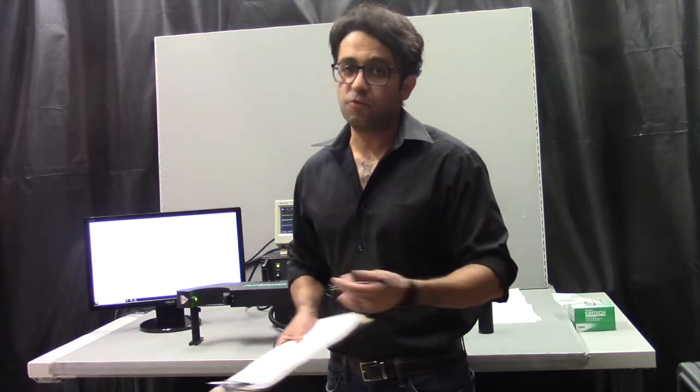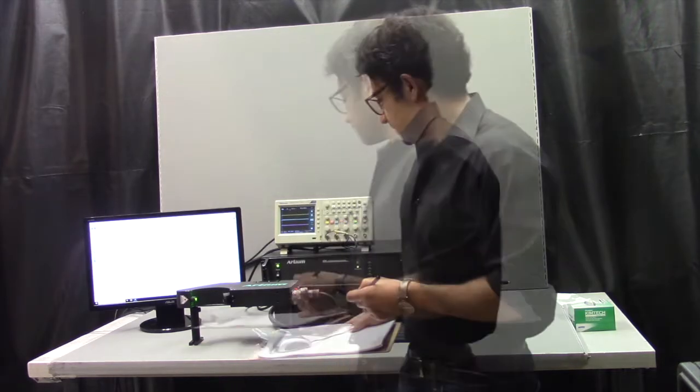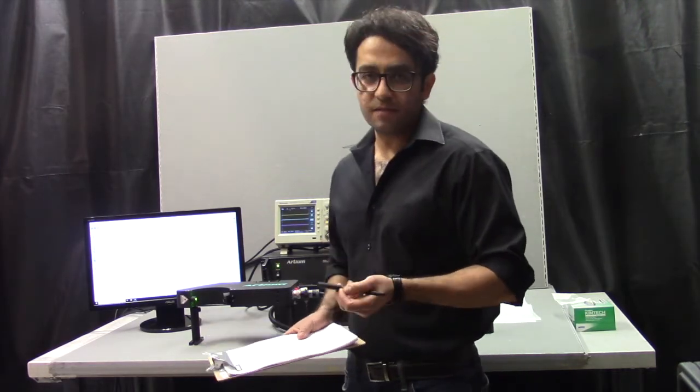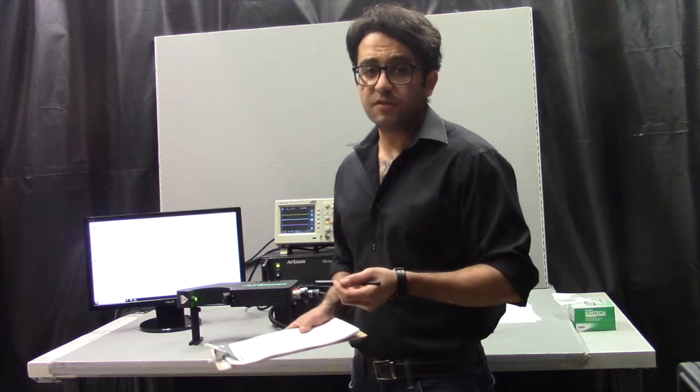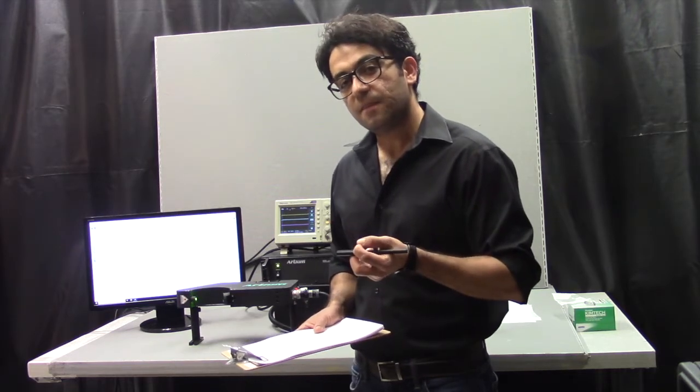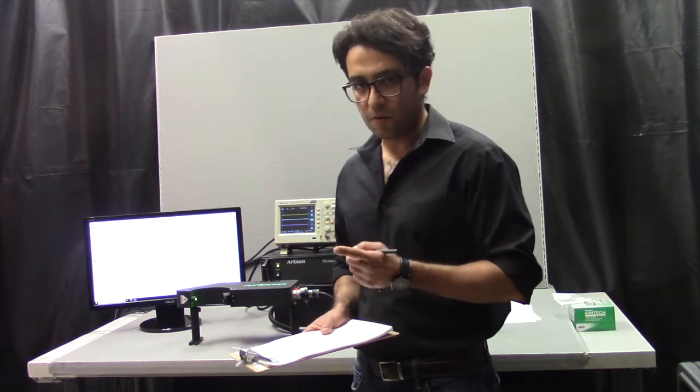Therefore, it doesn't require any alignment. We align it here in the factory and we ship it to you and you can turn the key and start using it. The TK is a 1D system. It means that it measures the size of the droplets and it also measures one component of velocity.